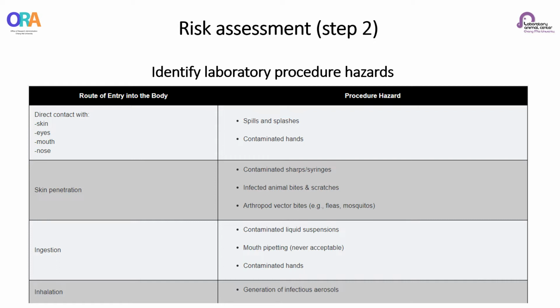Procedures involving an animal can present a number of hazards such as bites and scratches, exposure to zoonotic agents, and the handling of experimentally generated infectious aerosols.